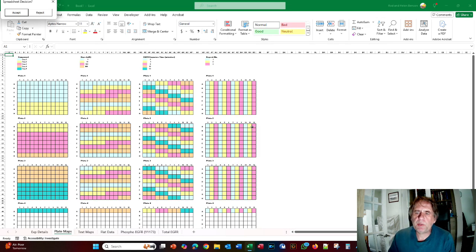Okay, so if we now look at these plate maps, first of all we can see that we have triplicate samples and we have 5 time points. So it almost fits nicely into this plate, because you can see obviously 4 3s are 12, so the first four fit really nicely, but there's a little spillover here, which is why you can see this shift of 1 as we start each dose. You can see it jumping down in this diagonal. There's a nice pattern here, and this is a really good demonstration of how the plate maps can help you understand what is happening. So for instance, if you only had 4 time points, it would fit really nicely, but because of 5 it's overhanging.